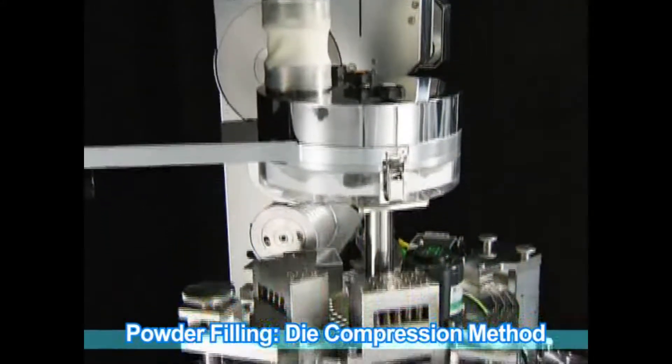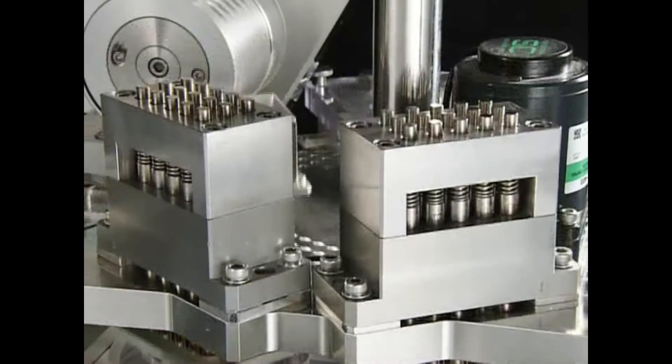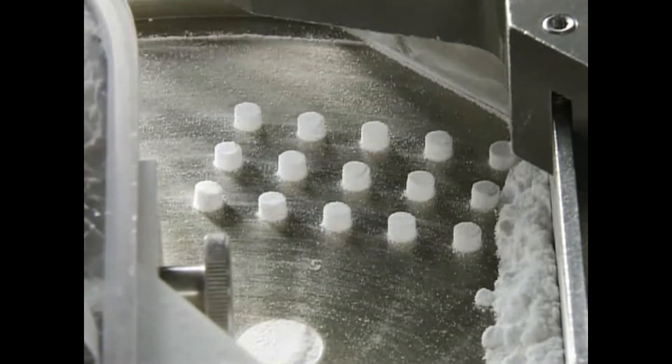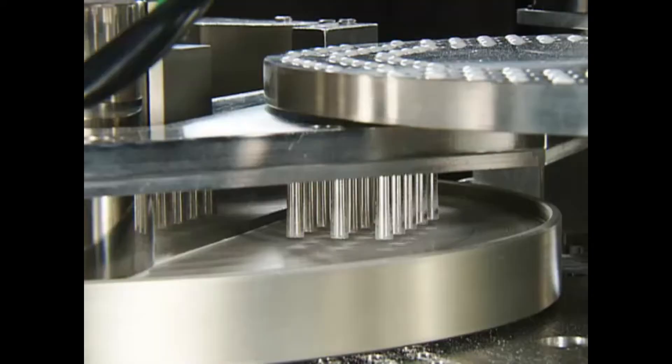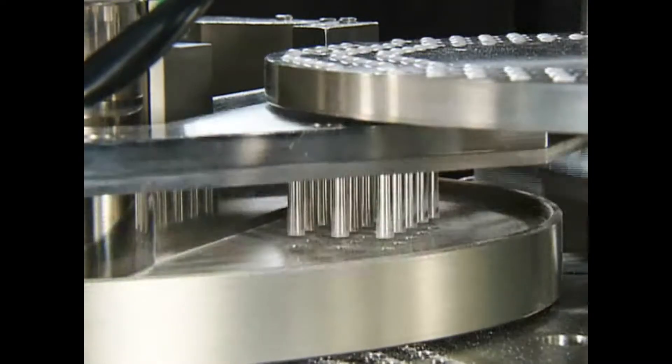After powder is distributed by the measuring disc, it is compression molded in with spring-operated plungers. The formed powder slug is raised up and powder deposited on the disc is scraped away. The weight is adjusted and it is filled into the capsule body.